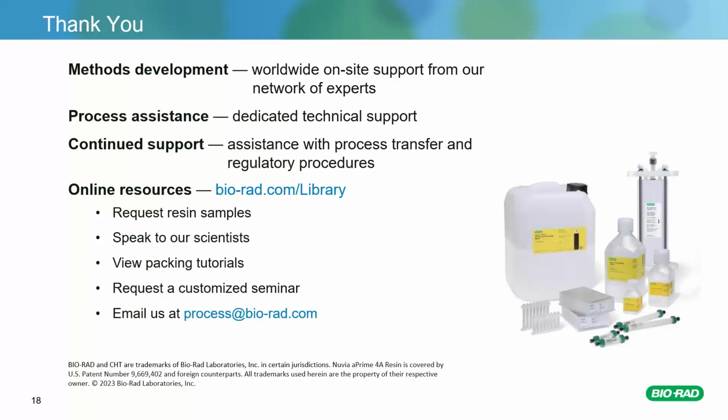Oh, thank you for this question. Yes, we can see that mixed mode resins, generally speaking, are gaining more and more interest in the field. There is a known example in the industry using a Nuvia A Prime resin, which is a slightly hydrophobic anion exchanger. Obviously, the level of HCP and DNA was within the spec. It is a nice example as the virus clearance in this project reached a decent value above 5 log reduction, and that was for the xenotropic murine leukemia virus.